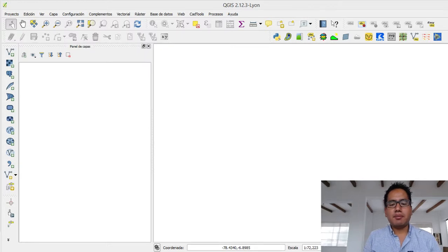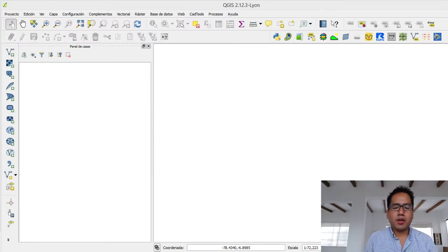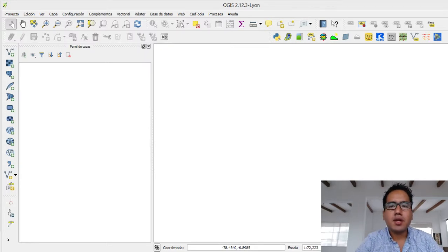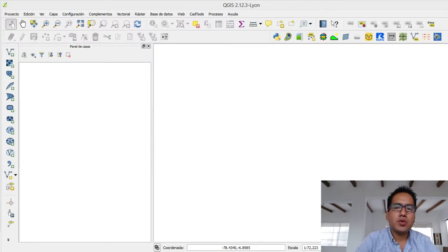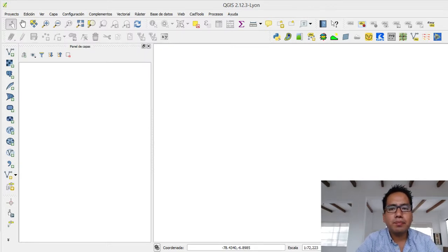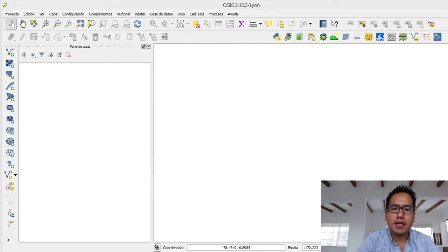Hi, my name is Saul Montoya from Hatari Water and this time we are going to do a tutorial on how to represent water chemistry data on QGIS.